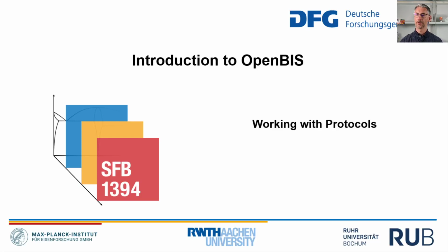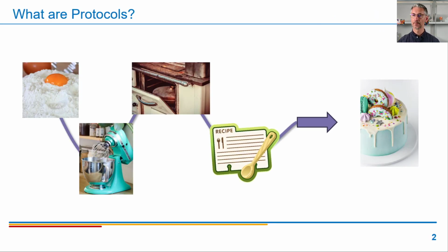Hello and welcome back. We now take a closer look at how to work with protocols in OpenBIS. So before we start, what actually are protocols? We're quite familiar with them in our everyday life. Take for example if you want to bake a cake.